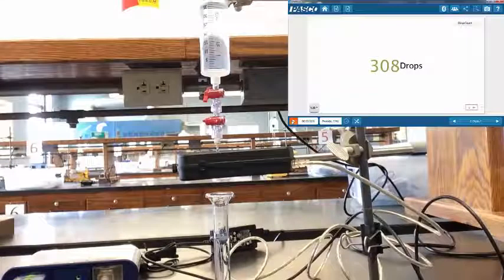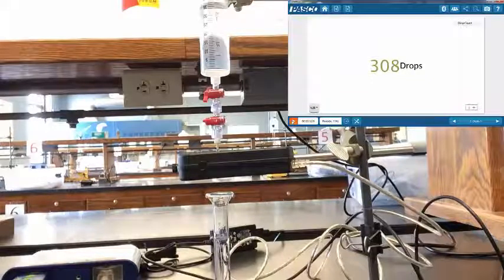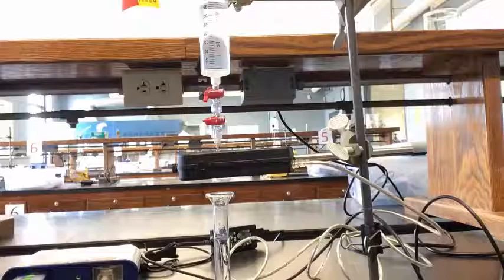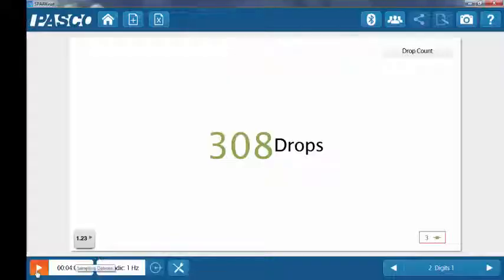Turn off the bottom stop cock when the graduated cylinder contains between 9.5 and 10 milliliters of titrant. Once the stop cock is off, press stop to stop recording data.